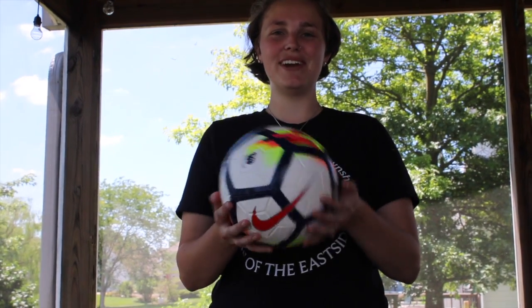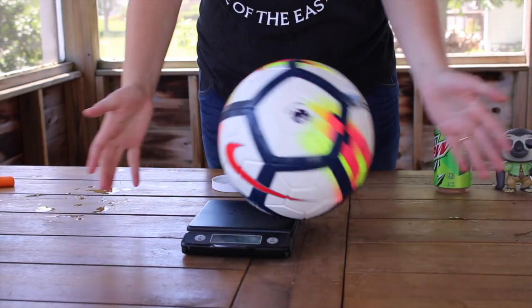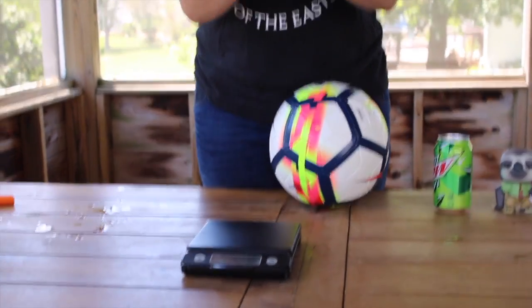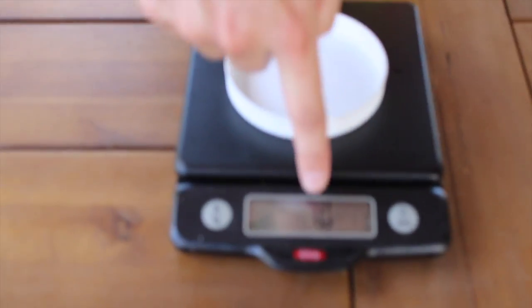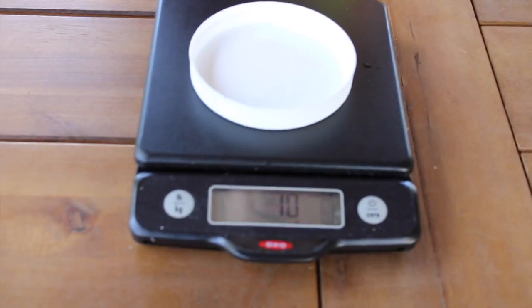We're going to find the mass of the inflated soccer ball, but there's something different about this one. Since we inflated it, it's now a ball, and balls like to roll. So if we were to set it on here, it's going to roll off. So one thing that we need to do differently is we're going to use this cap, which will hold the soccer ball on. And so if you look here, we put the cap on and it says that the cap is 10 grams. But we don't want the weight of the cap, we want the weight of the soccer ball only.